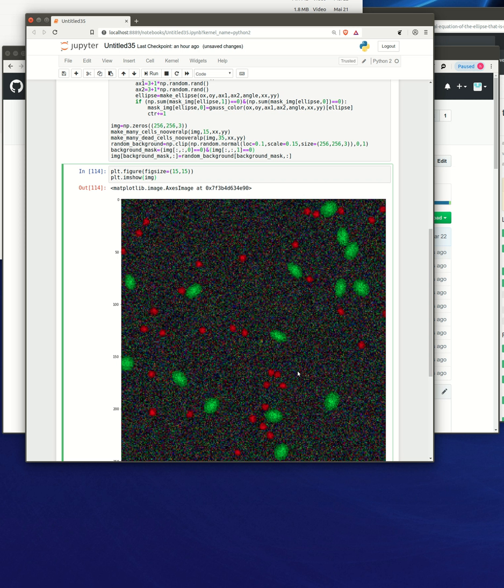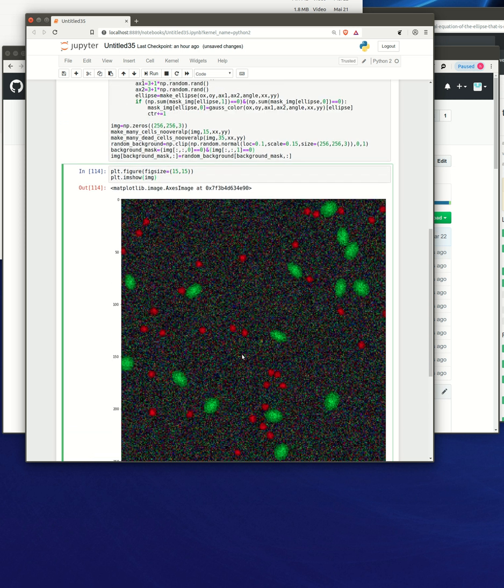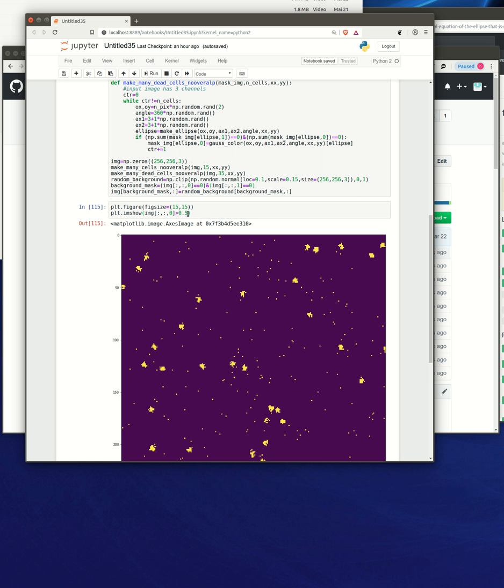So just to check if this is the produced output from the network, you can query, for example, all the red patches that are bigger than a certain number, and you can see that still some noise spikes get over the required threshold for you to detect the cell. So maybe you don't want that, and you will just keep the noise a little smaller.